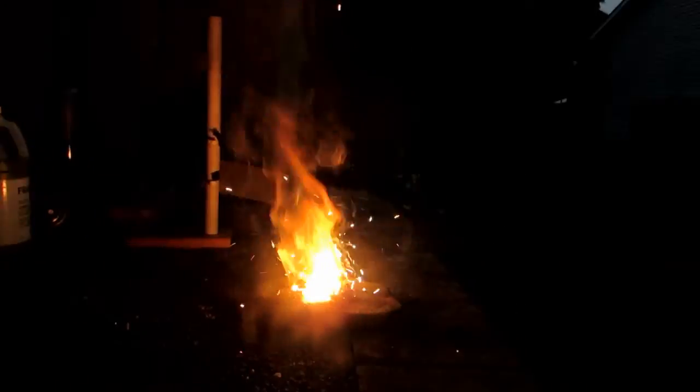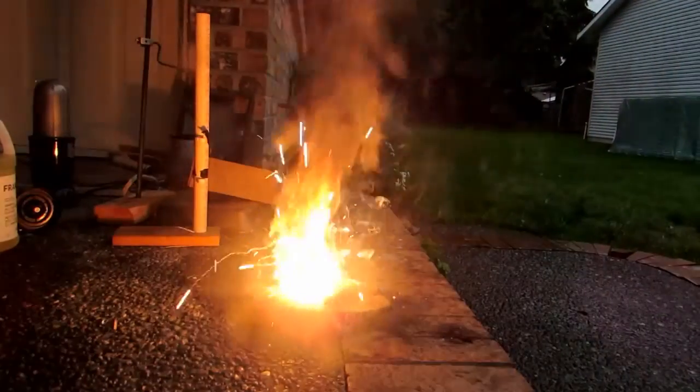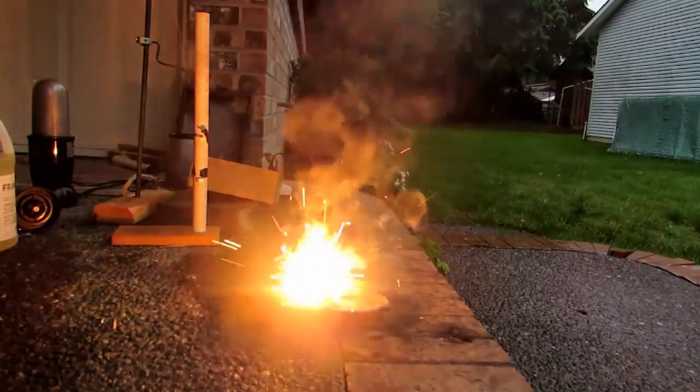Very, very, very reactive. Holy goodness. And it's still not done.